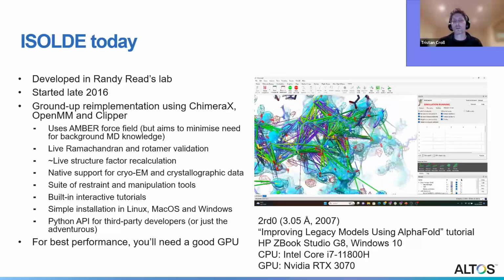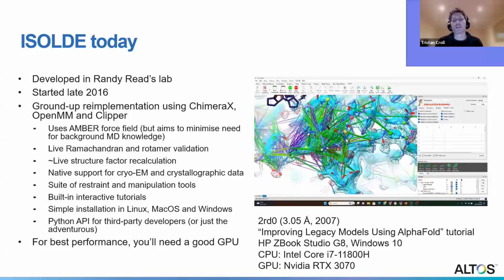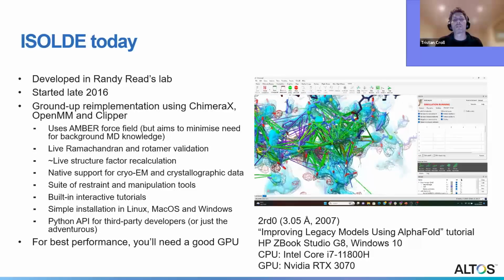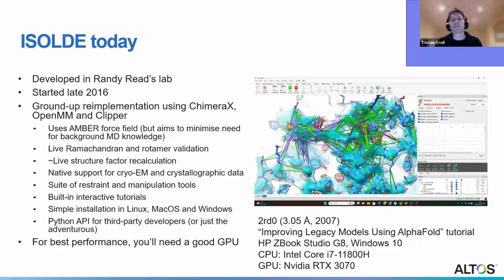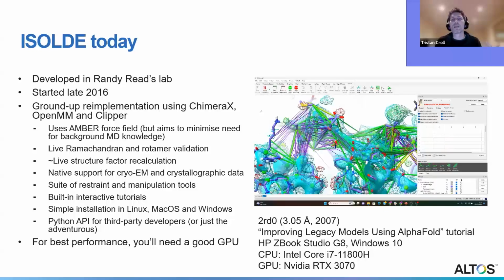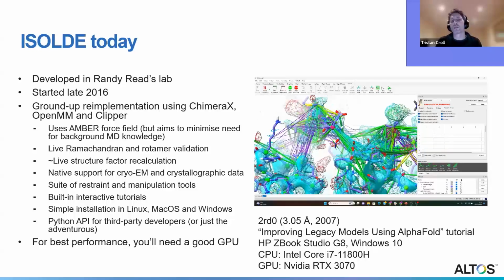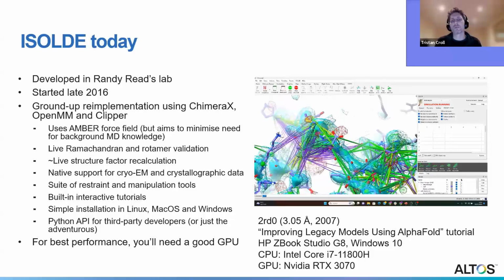When you're working with protein, nucleic acid, your classic N- and O-linked glycans, all of those sort of things, you should be able to just work with it. And the idea has always been to try and make everything feel like you're working with real atoms as much as you can. So when you tug on things, they're behaving like real atoms.